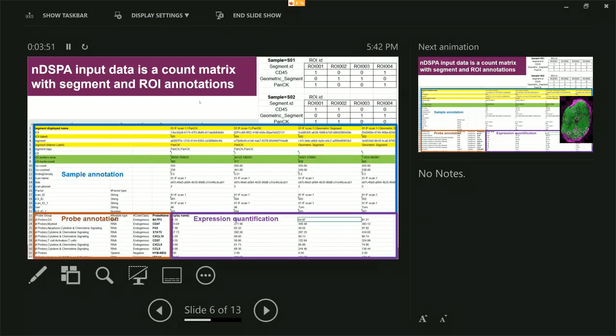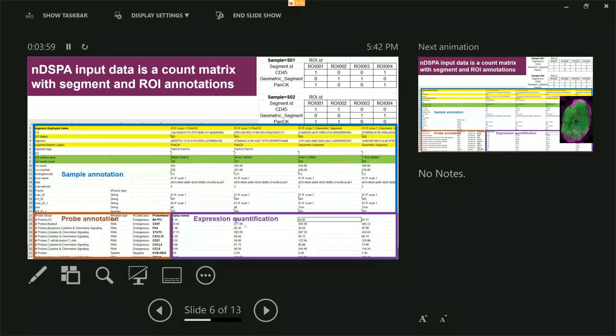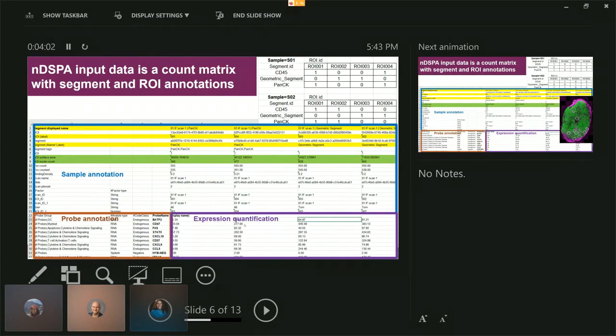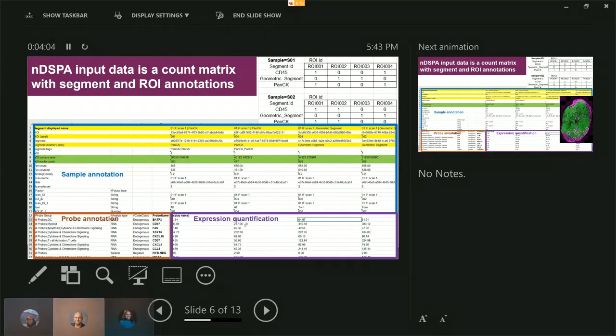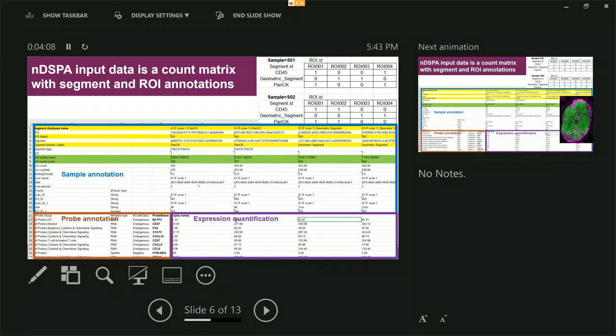So for those that have not seen nDSPA before, this is the data frame that is the input for the software. This looks very similar to Nanostring count data, however, it has two key elements that are very different and makes it distinctive from the traditional quantification.